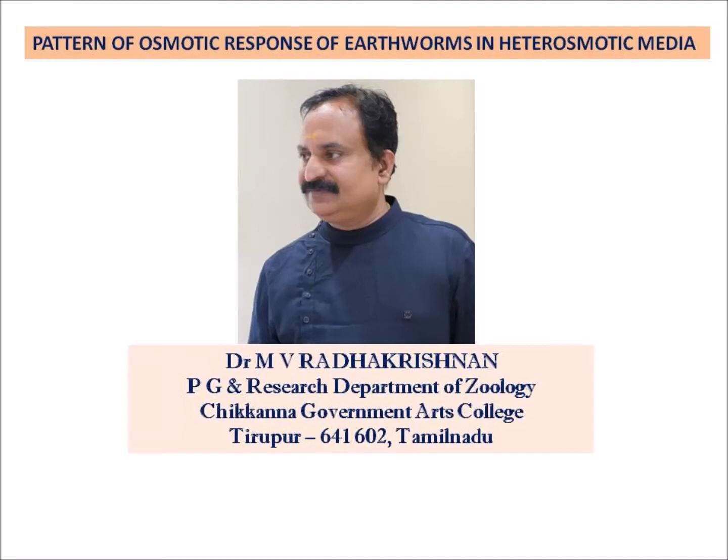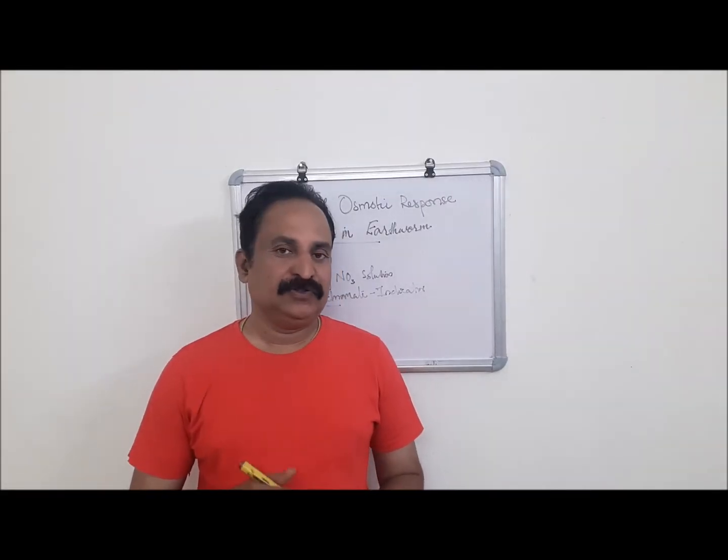Hello students, the topic is the pattern of osmotic response of earthworms in heterosmotic media. Pattern of osmotic response of earthworm.